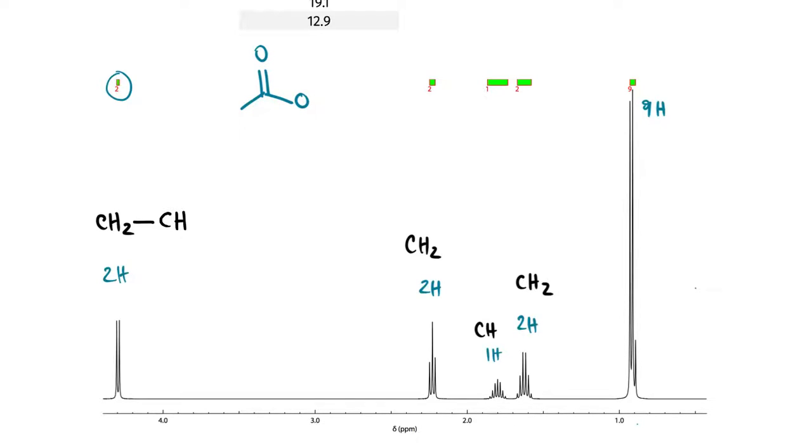So what that also means is that this is probably our connection on the left. All right? So we assigned our CH2. This is a poor choice of color. Let's try this. Okay. Now, let's move over to the neighbor, the CH.